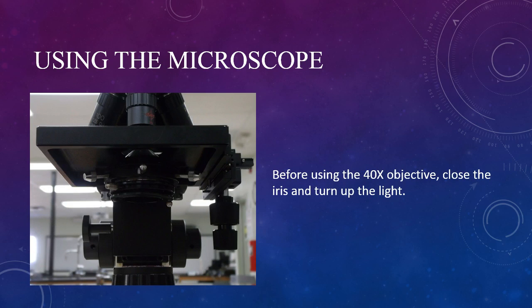Before going to 400x total magnification, we need to adjust the setup a little bit. We'll turn up the light using the brightness adjuster, and then close up the iris located under the condenser lens. This is done with a small peg that slides back and forth.